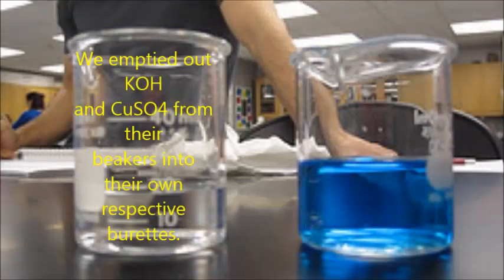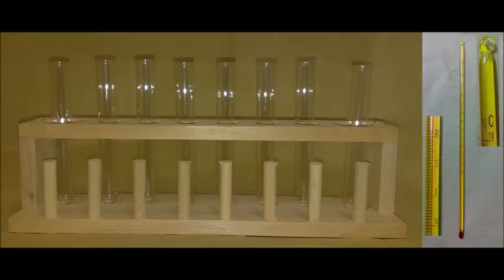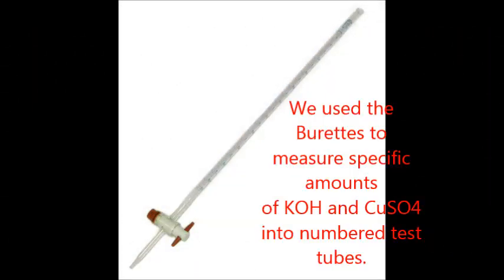With this information, we conducted a lab to identify the limiting reactant in a chemical reaction and to observe how different ratios coincide with the limiting reactant. In our experiment, we filled one burette with potassium hydroxide and another with copper sulfate. We then used the burettes to fill 8 test tubes with 5 milliliters of copper sulfate and escalating amounts of potassium hydroxide. We then added water to the test tubes to make the solutions equal in height.